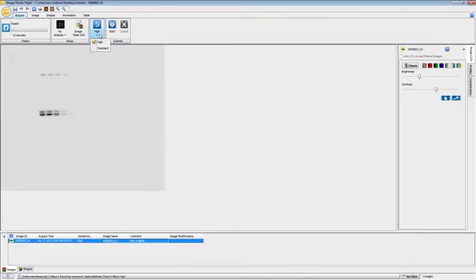I suggest using the high sensitivity image setting as a starting point for your first scan. It's honestly what I always use, but keep in mind, you may need to try different settings to get the best image for your samples.